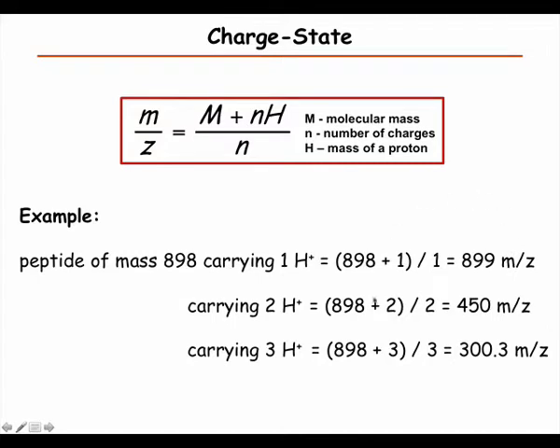So it's quite straightforward how to calculate the masses, but one should remember this formula. And of course, these are just integer numbers, but nowadays, if we measure things down to a few parts per million, we need to use the exact mass of the proton.